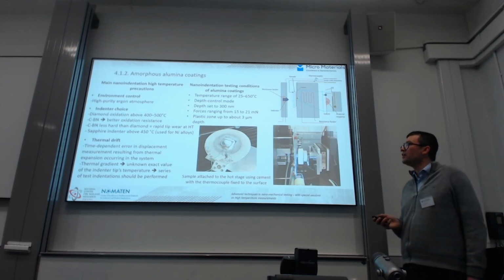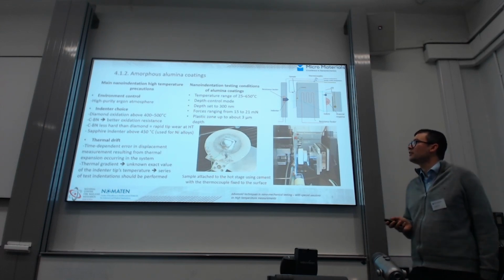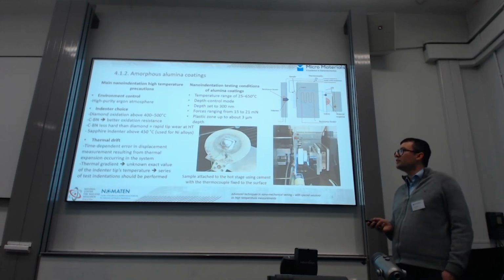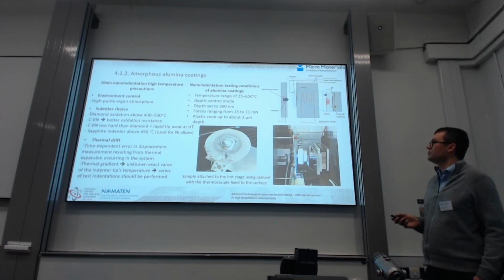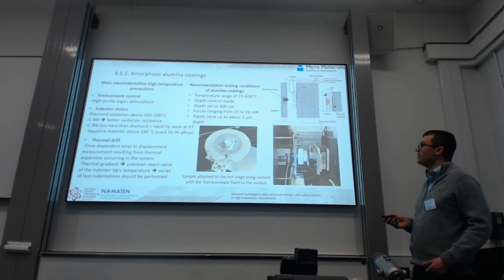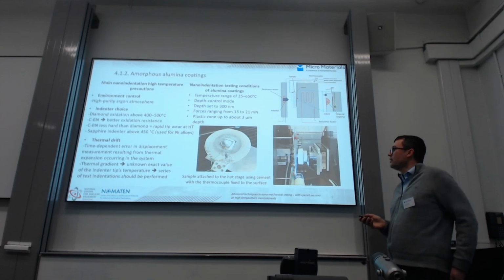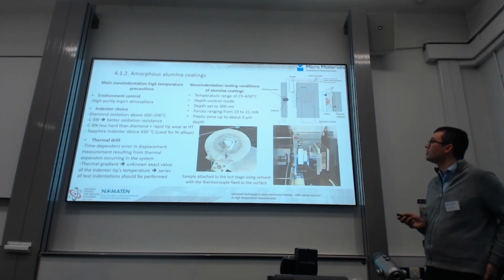So we perform our nanoindentation with a cubic boron nitride indenter. And of course, we should know that there is a thermal drift, so we should be careful in analyzing our results. And here are our samples that were attached using this special cement on the hot stage holder.